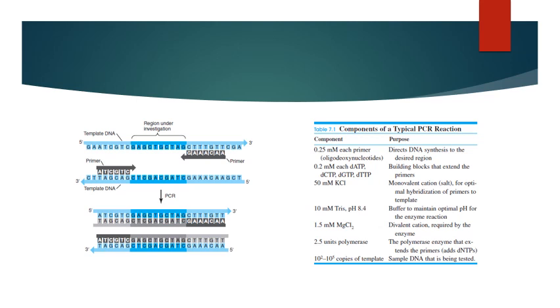The other thing, of course, a little bit cheaper, is decontamination of the workspace with a 10% bleach solution. So frequently wiping down your bench tops, your hoods, any surface that comes in contact with any specimen material with dilute bleach or alcohol will remove most DNA contamination. There are several other methods, commercial products that are also available. Those are the basic ones that help in most laboratories.